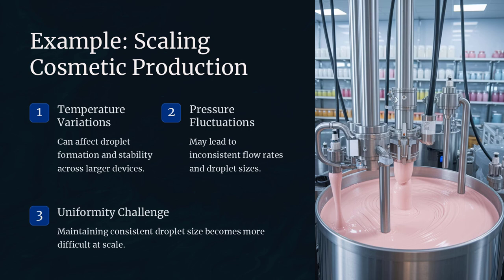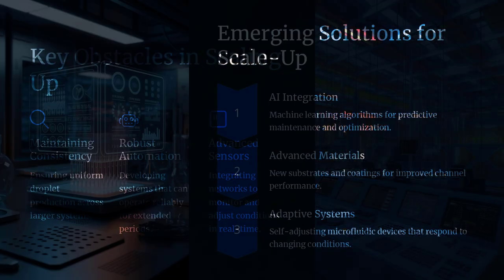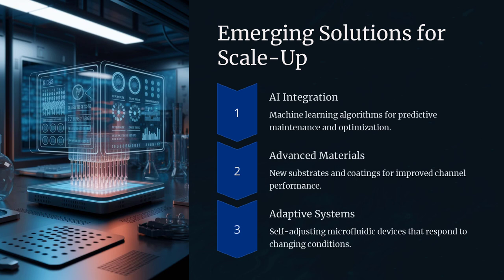In practical terms, when a surfactant is added to a system, it forms a protective layer around each droplet, preventing them from merging uncontrollably. Consider the example of mayonnaise in culinary arts, where egg yolk acts as a natural surfactant to combine oil and vinegar into a stable emulsion. In microfluidic devices, similar principles are applied, and the careful selection of a surfactant, taking into account factors such as critical micelle concentration and biocompatibility, is essential for applications like drug delivery, where the stability of each droplet can affect the controlled release of medication.